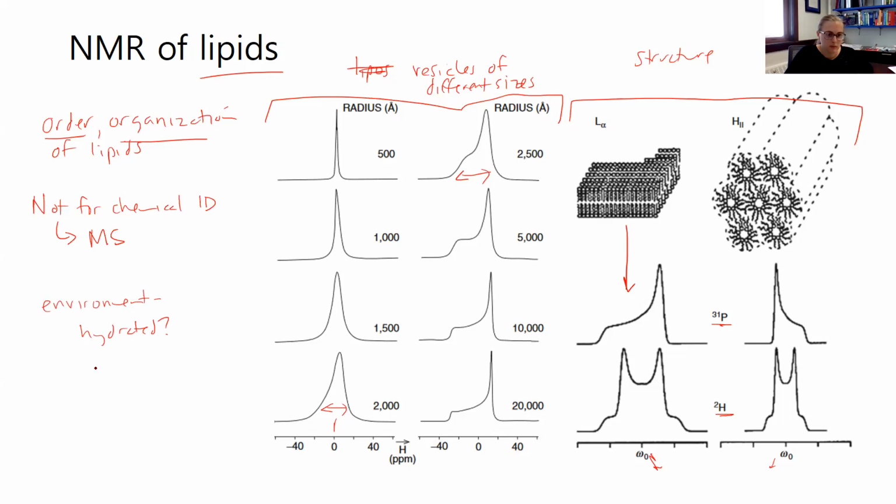Also, given these structures, NMR is used in solid state forms, and also magic angle spinning, which is when you're doing a solid state measurement of NMR. If you measure it at a certain angle, you can reduce the amount of noise or background that's present and get higher signals. So mostly organization with looking at lipids.